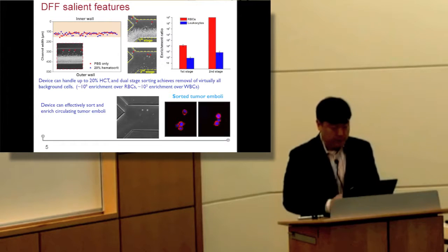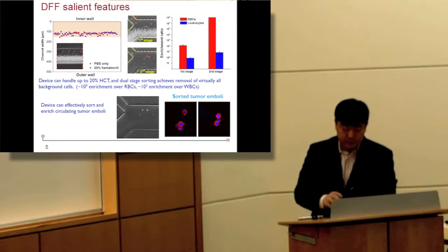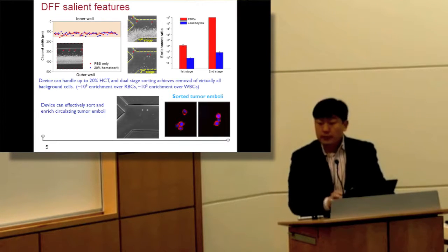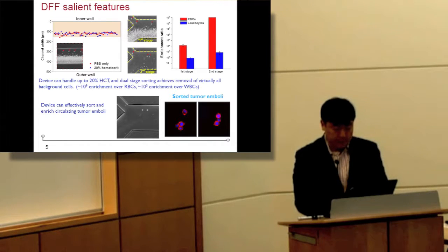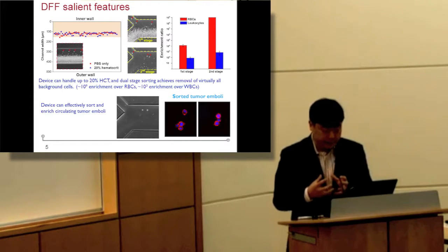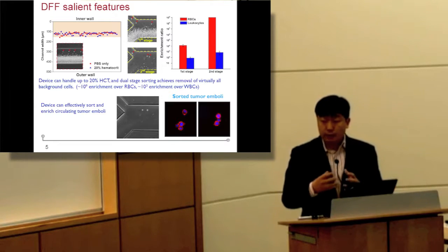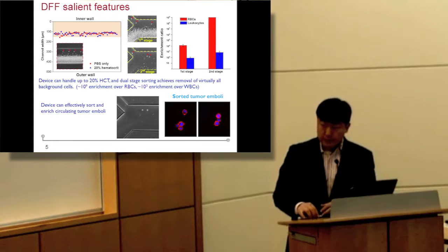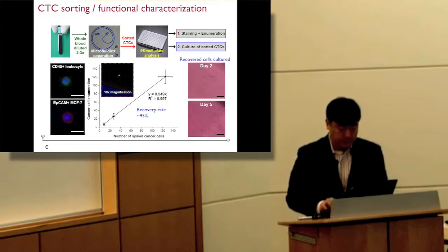The other good thing about this device is that it doesn't really touch the target cells. What that means is that everything happens in solution. At the end of the device, we have a tubing that collects the solution that only contains these target cells, in this case, CTCs. What that means is that we are capable of collecting some of the other targets, such as tumor emboli or tumor aggregations. That's maybe interesting for the downstream analysis, because now we can actually have a sample preparation device that can collect some of the low abundance species.